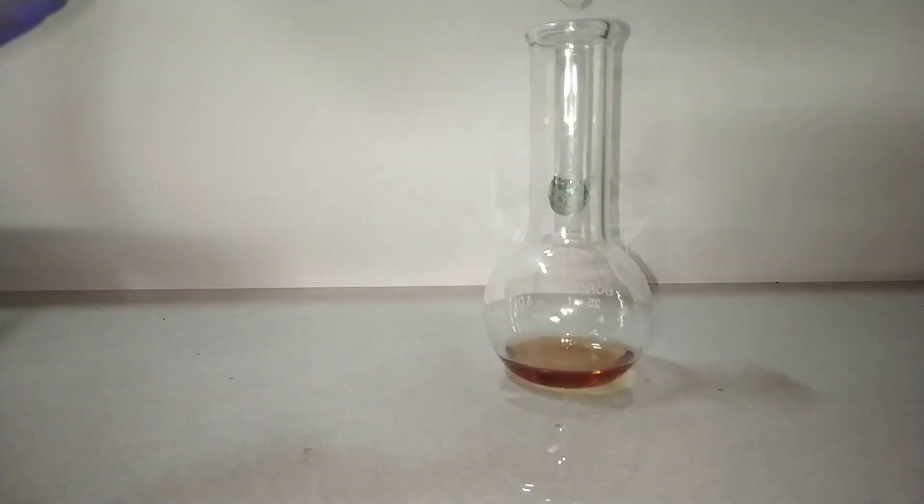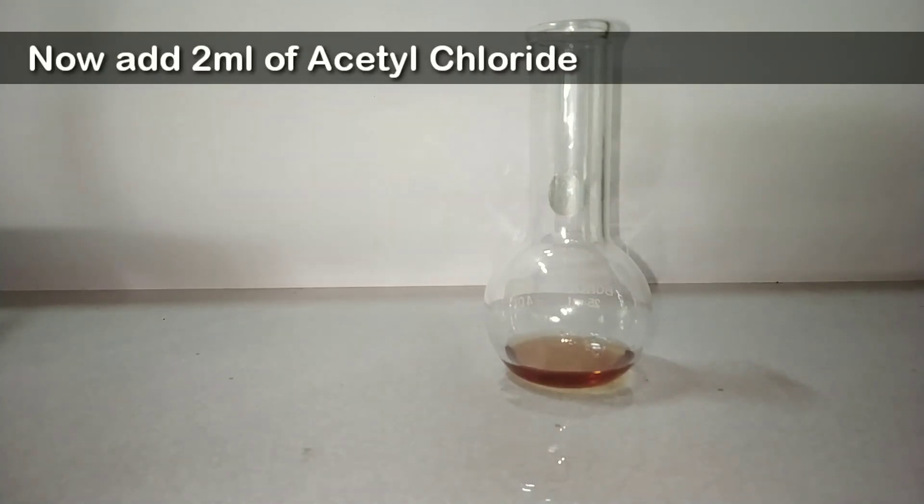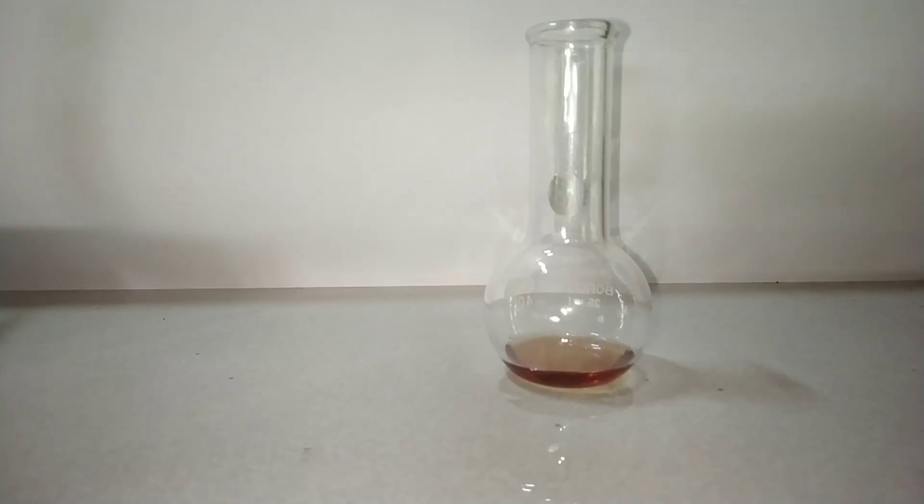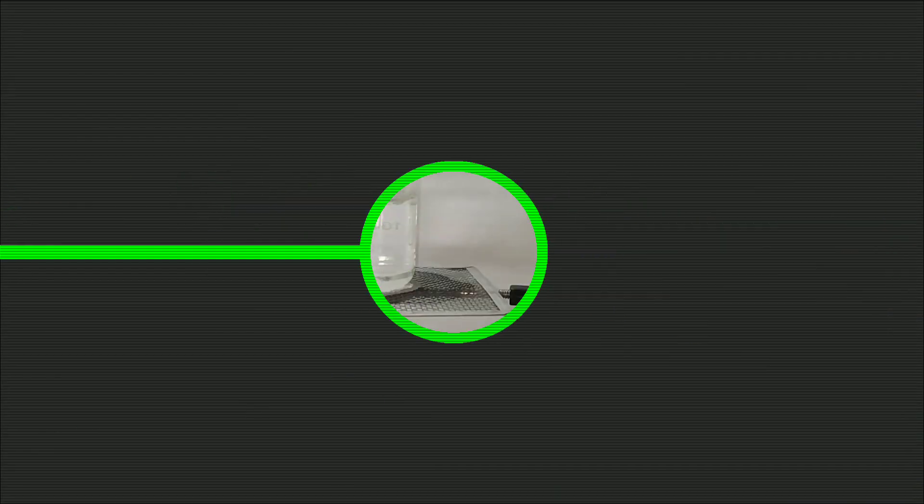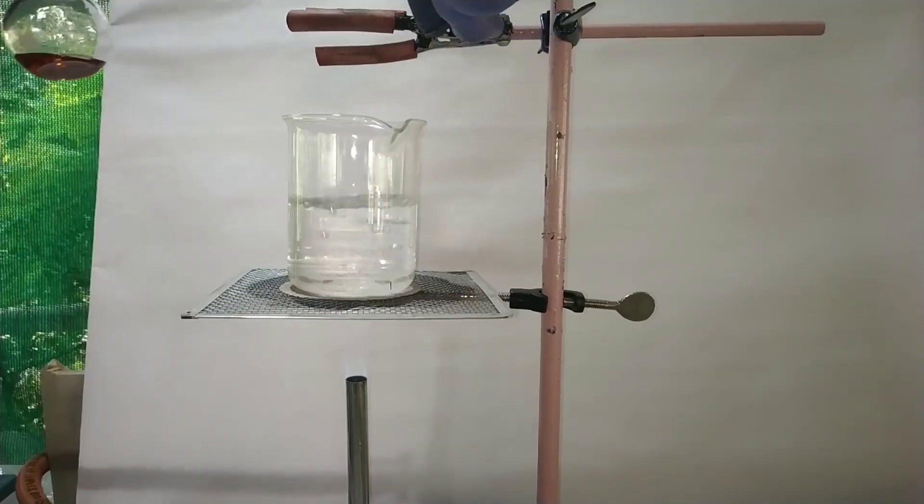Now we will be adding 2 ml of acetyl chloride. Add the acetyl chloride in small quantities as temperature can rise up while adding it. Be very careful with acetyl chloride as it fumes in moist air and its vapors are toxic.